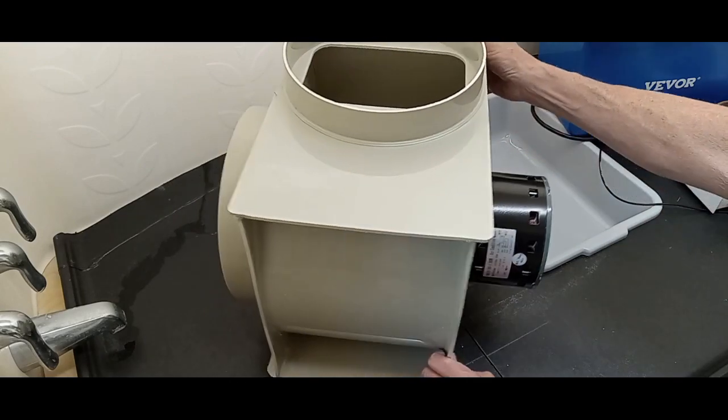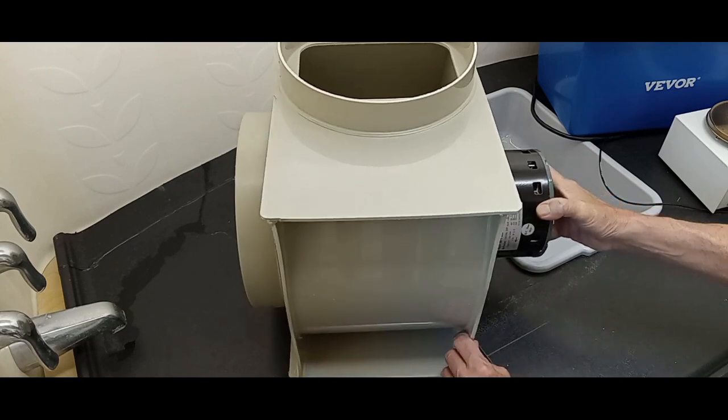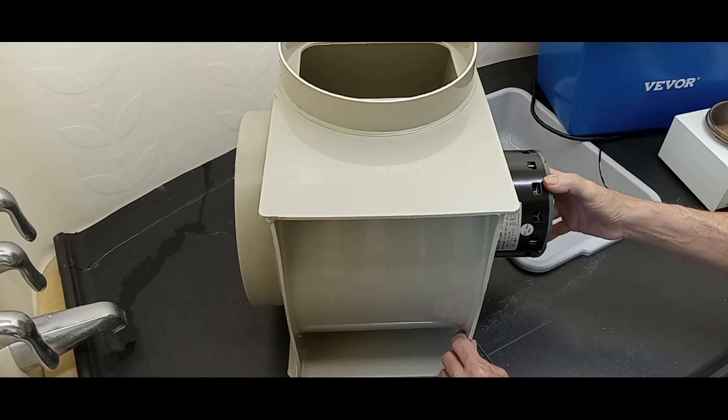There was nothing in the information that denoted this as a multi-speed fan, which was kind of a downfall, but actually this is a multi-speed fan according to the winding diagram on the motor.